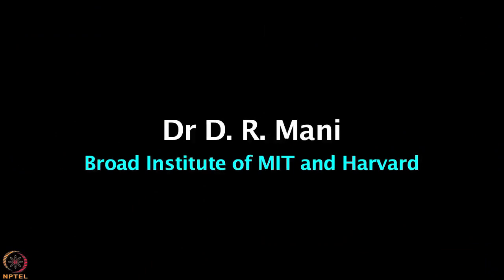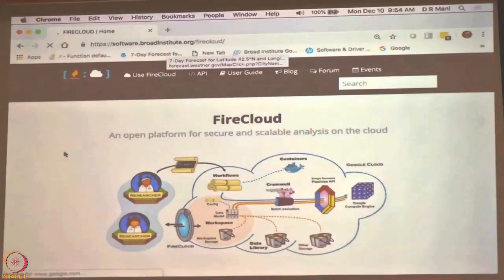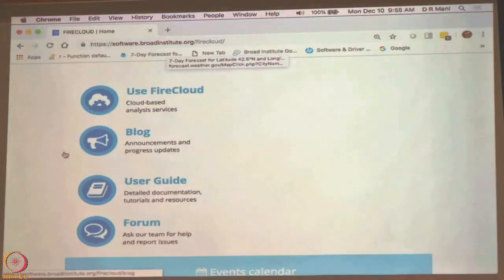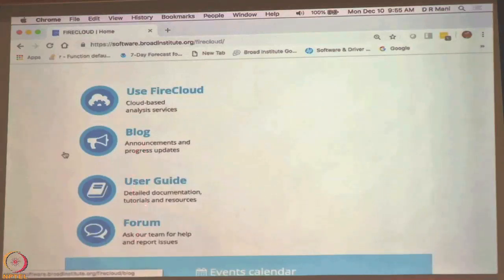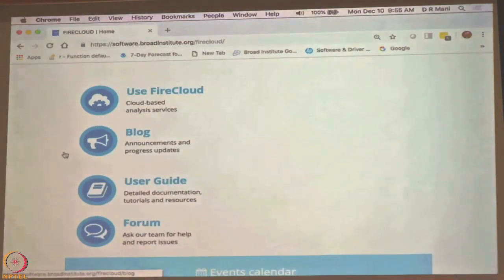Let us welcome Dr. Mani for today's demonstration session. If you type firecloud.org, it will go to the home page, which shows the same picture as before, but it will also have these other elements. If you want to start using FireCloud, you click on 'Use FireCloud.' There is also a user guide — if you click on that it will give you a lot of information on how to use FireCloud. There is also a user guide for WDL which you can access separately, and a lot of the documentation has been reasonably well written.